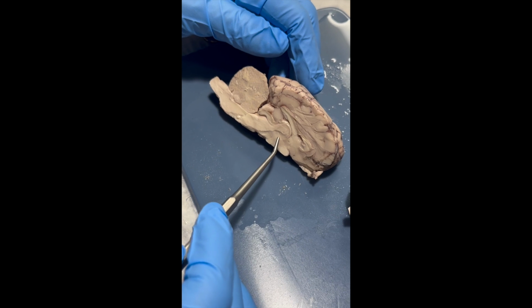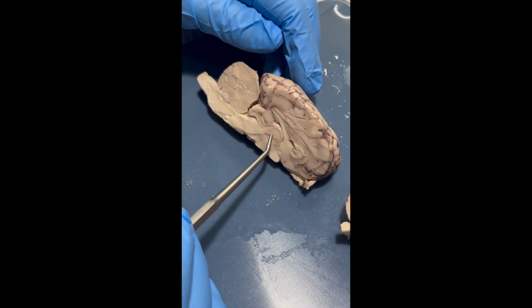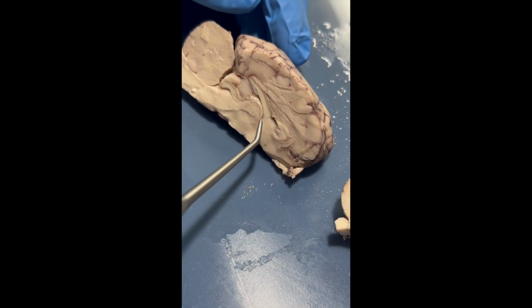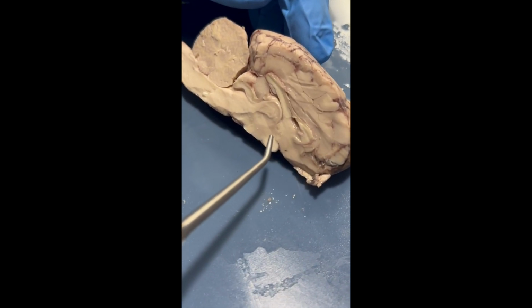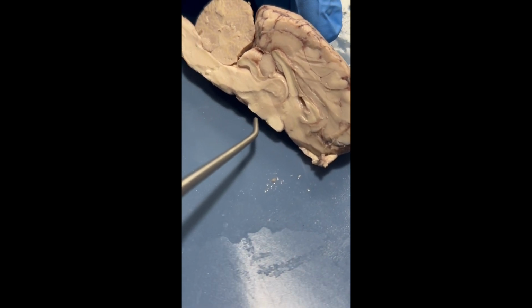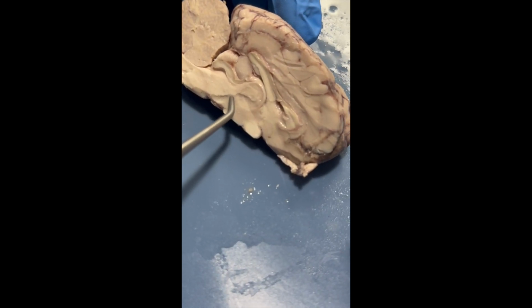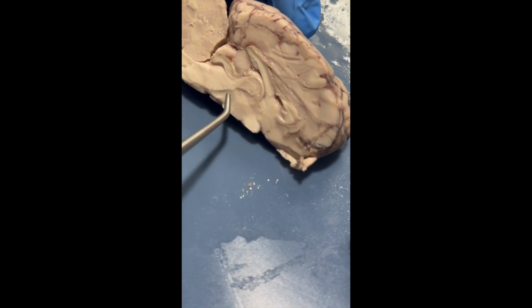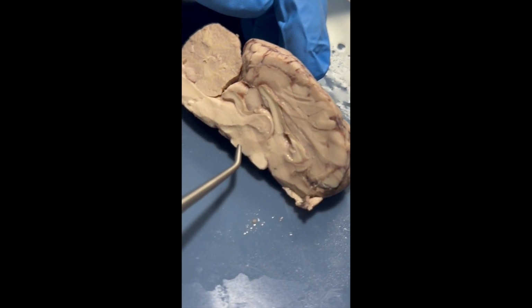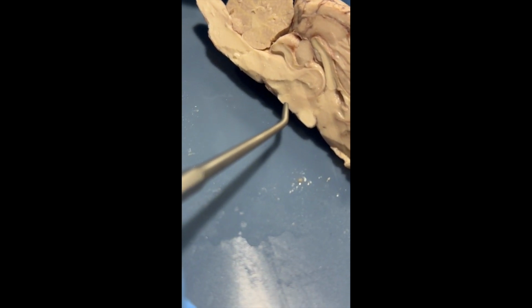From here, we can move to the diencephalon, which is the thalamus and the hypothalamus. This is the thalamus. It is a relay station for the entire brain. It basically connects the brainstem and the cerebrum, and connects a majority of the brain to itself. The hypothalamus is found just inferior to that, and it regulates homeostasis, such as body temperature, fluid levels, things like that. The hippocampus actually wraps around here and is responsible for emotion, along with structures such as the amygdala. The hypophysis, or the pituitary gland, is directly below that, and it's a control center for a lot of the endocrine glands within the body.